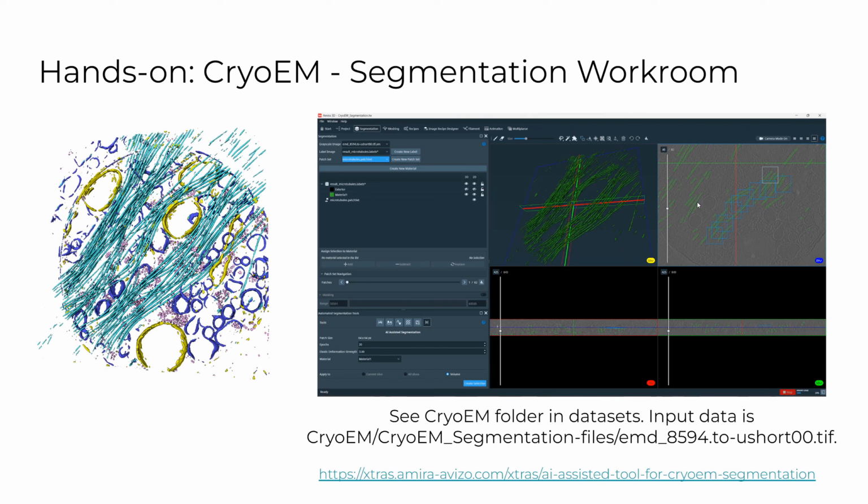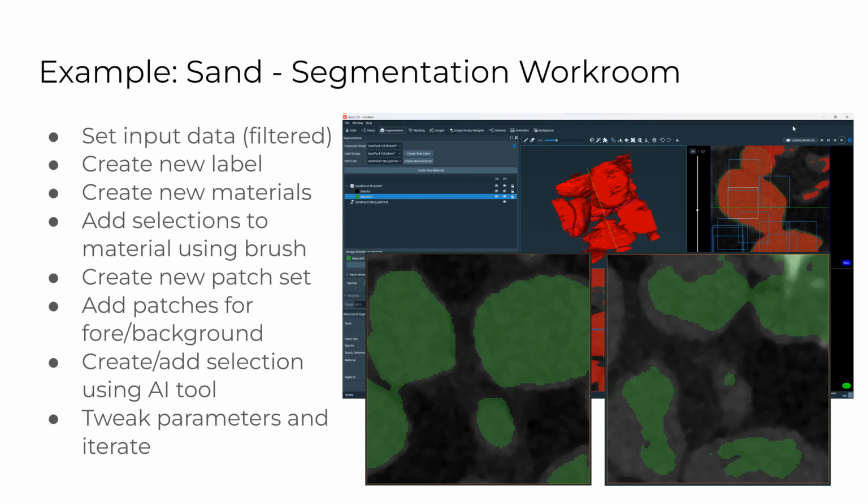About why AI did not work, maybe the size of one grain was... So I didn't play with the parameters. I just used the default parameters. From the image I see like 50 pixels per grain. You can see the patches here. But if you compare the size of a rectangle, it can fit a single grain size. Exactly. No, that's a good observation.